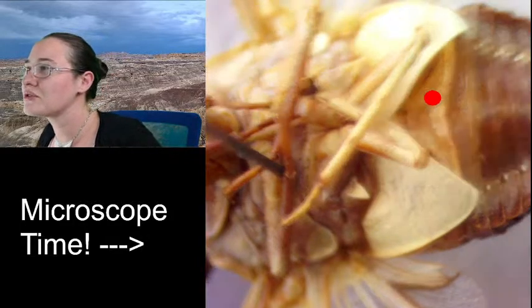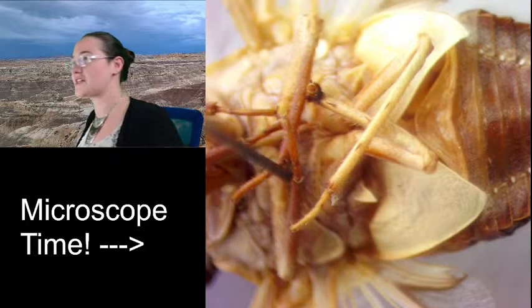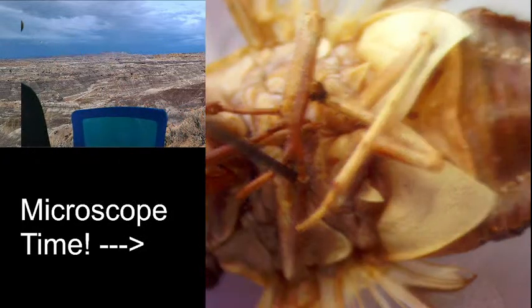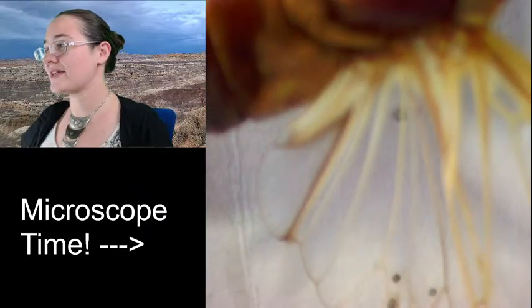Might almost show you the chamber. This is the chamber I'm trying to show you guys, the resonance chamber. Sometimes it's just easier to look in the microscope. I don't know if we're going to be able to see it, but I can kind of show you an example with my hands to give you an idea.